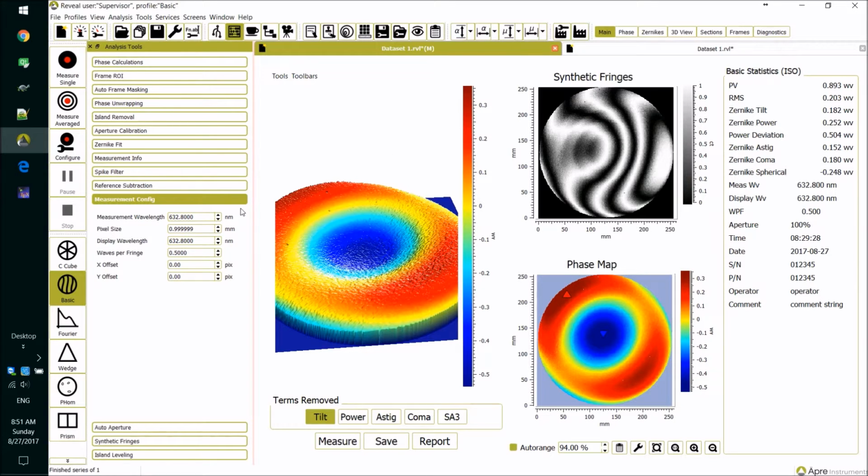Remember, the values you change in the dataset neither change other displayed datasets nor future datasets via the default setting, just the dataset you are working on. This is the difference between dataset and default settings.